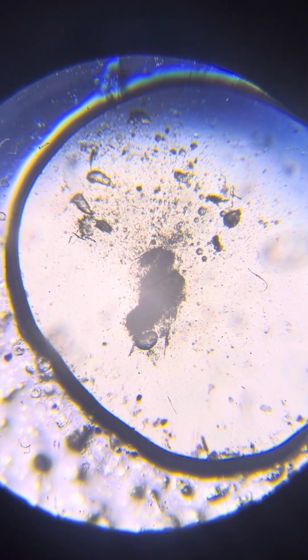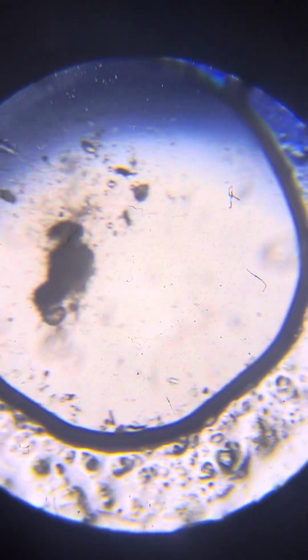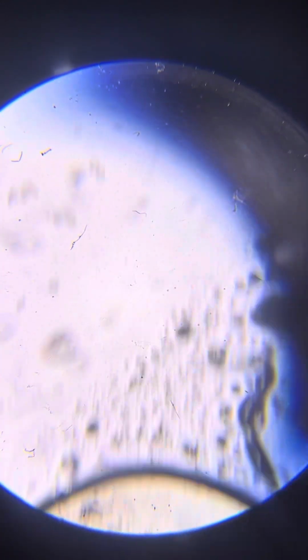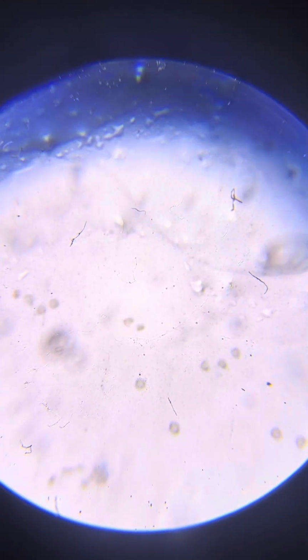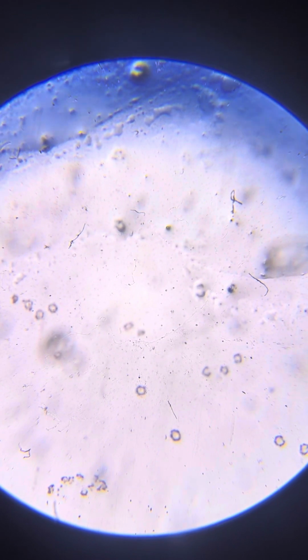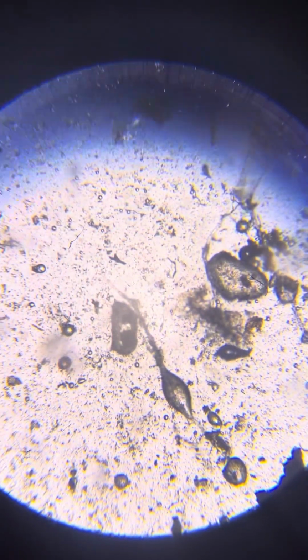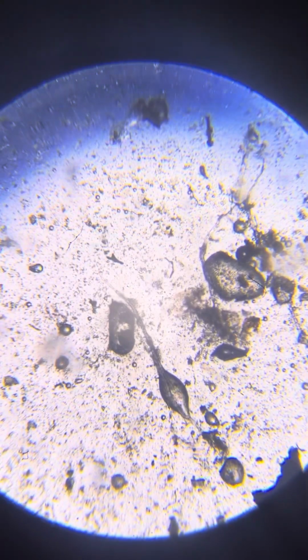And you see small Neros on the other side. Great. Of course, it doesn't mean that it leads to Venus. It probably leads to another place in the slide, in the container. But yes, this is an open portal for certain, and quite a big one, certainly in the Enterprise class. So this is a life form, perhaps? No, yes, I'm not sure. It's a life form with a water bubble.